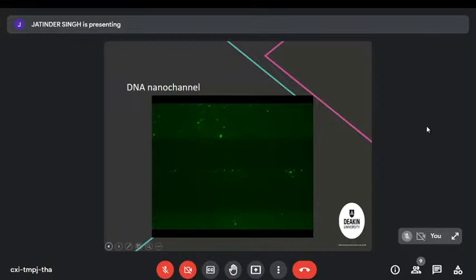Initially, there was a bit of playing around and people thought it was really cool this has happened. I'm not sure if you have used or heard about DNA sequencing and the nanopore instruments. This discovery of actually seeing DNA uncoil in nanofluidic channels has led to a lot of this nanopore sequencing, because DNA has a unique ability to uncoil when an electric field is applied, and then there's a way of sensing how long it takes to go through, which allows you to derive the length of the DNA, and even the different base pairs have different levels of resistivity. So if you measure the conductivity across the pore, you can even assign the base pair that's coming through. So nanofluidic channels, particularly for DNA sequencing, have enabled new research and allowed the field of science to progress further.